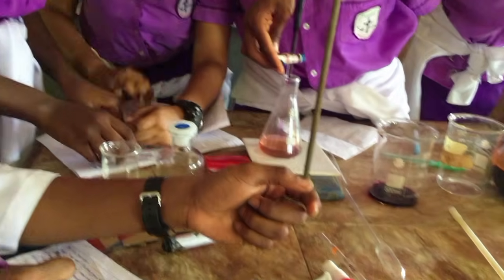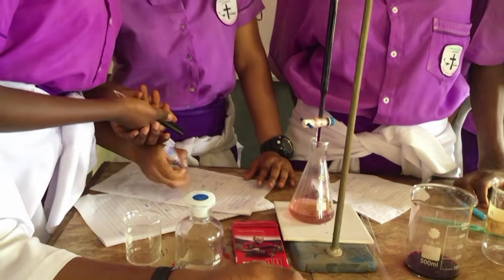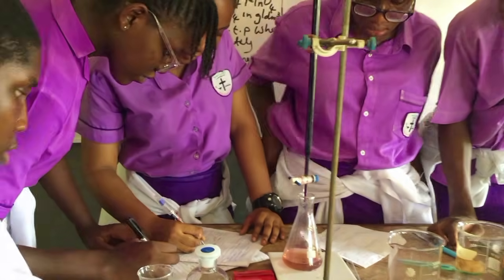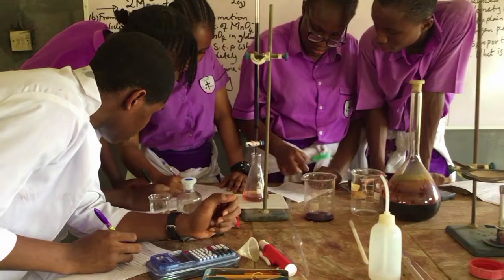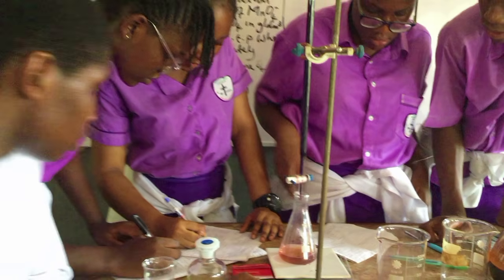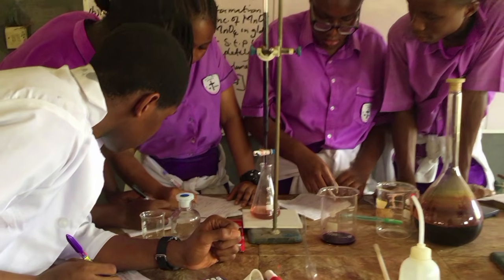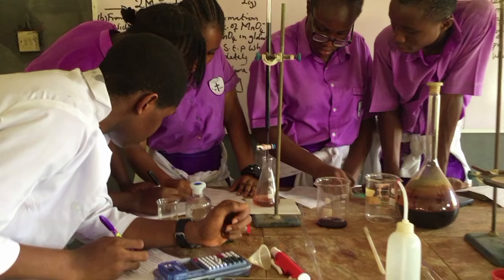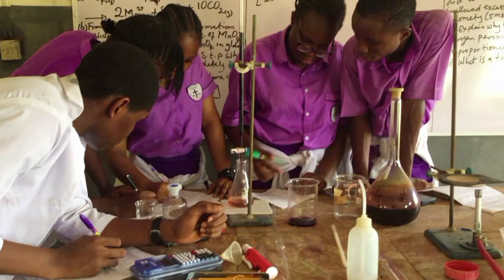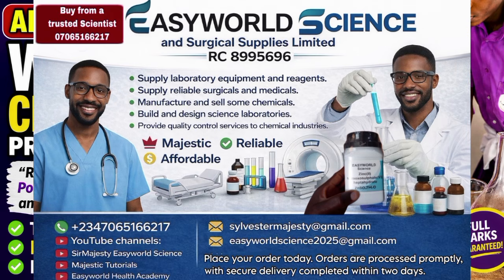Why are you adding it again? Is it stable now? And that is it. The endpoint has been attained, and the student whispered 26.7 or so. I don't get them well, but their initial was not 0.00 because taking the lower meniscus becomes very difficult because the KMnO4 is colored. So their initial was probably 1.0.